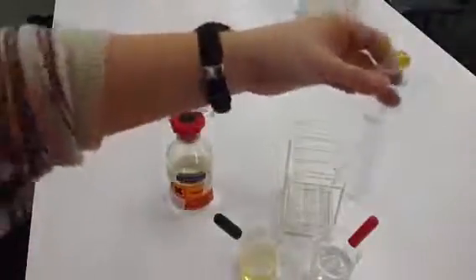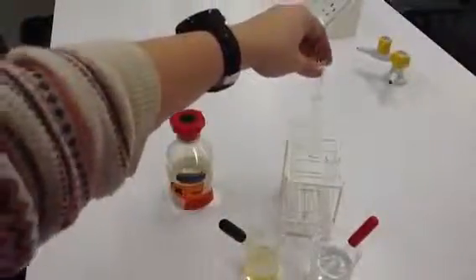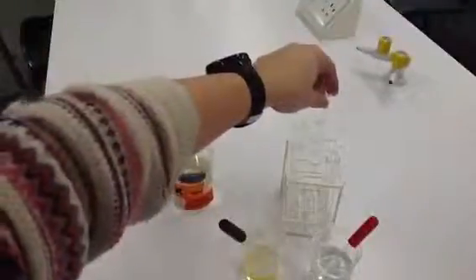So if we do the same with tube B and observe the tube, it hasn't turned into that milky emulsion colour. So just comparing tube A with tube B, you can see tube A has a milky emulsion and tube B doesn't. So this is indicating that sample A did in fact contain lipid because it turned into this milky emulsion, whereas sample B stayed quite clear. It didn't convert into a milky emulsion, indicating that lipid is not present in this sample.